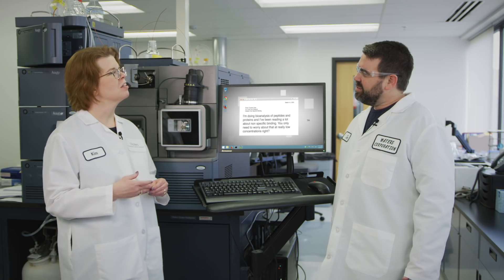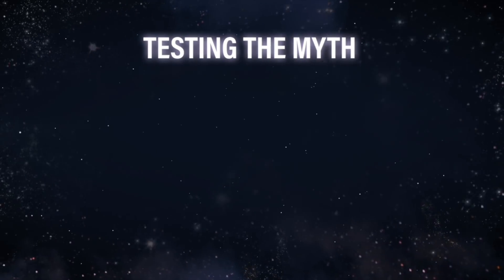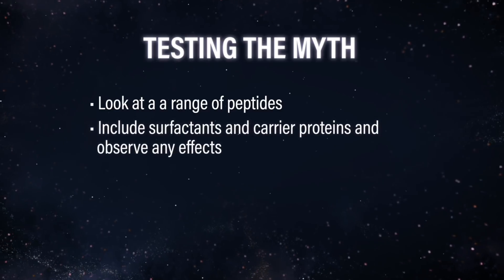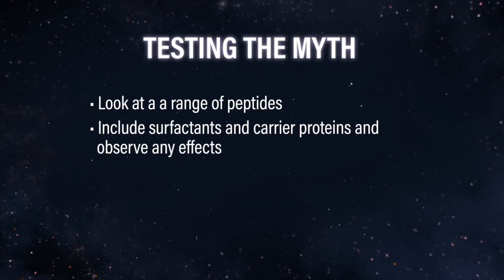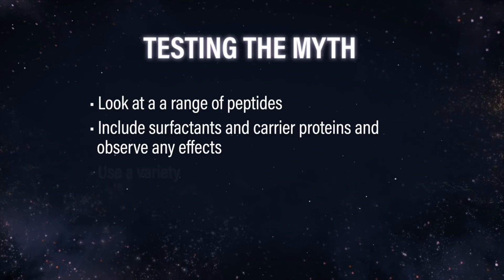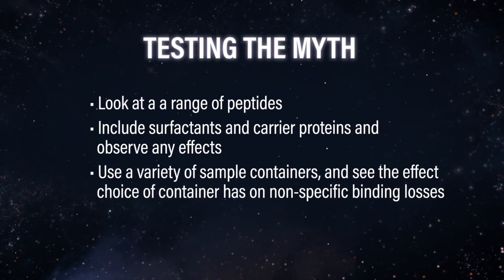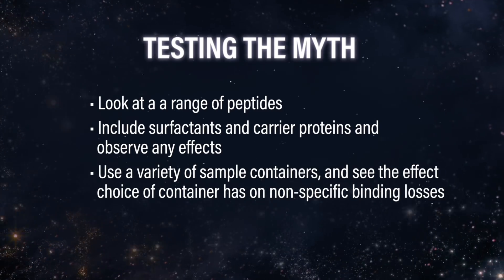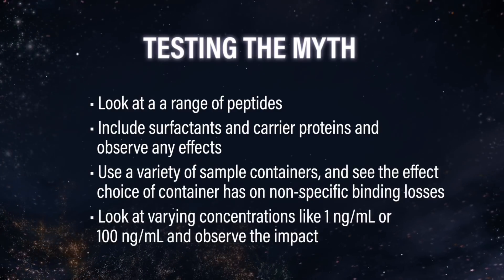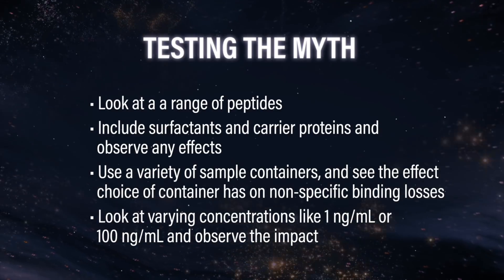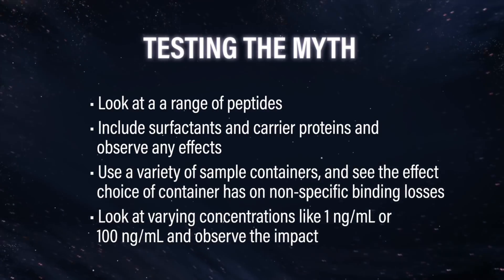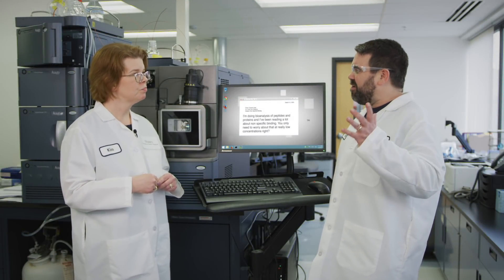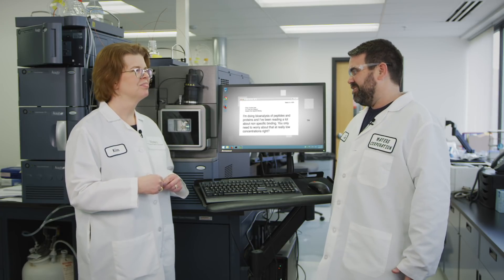I think we can do some myth busting here. We can design an experiment that will look at a range of peptides, and we should look at those surfactants and carrier proteins that people use to reduce nonspecific binding and see if there's any effect. We can look at a variety of sample containers and see what the choice of container has on nonspecific binding losses. And to specifically address this question, let's look at varying concentrations — something at a low concentration like one nanogram per mil and maybe 100 nanograms per mil — and see if there's a difference.